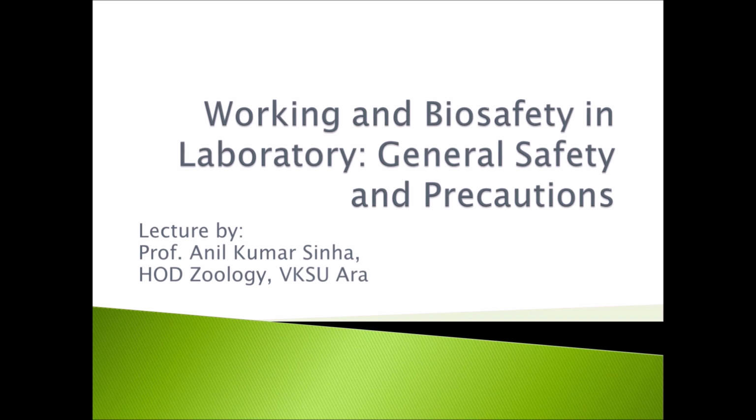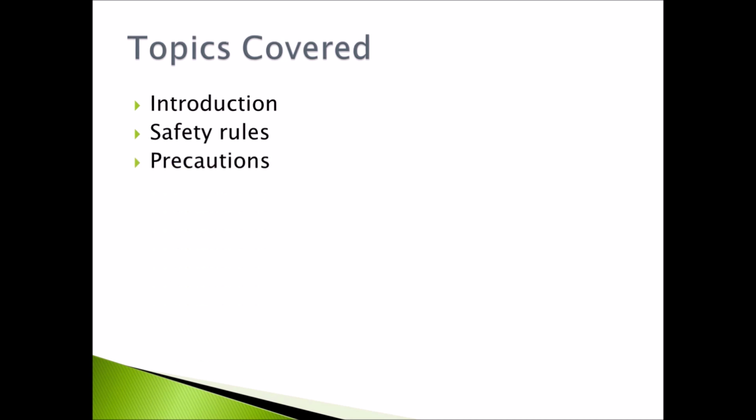So, let us start with the points which have been covered in the topic general safety and precautions. The topics covered are introduction, then safety rules, precautions, summary, and references.